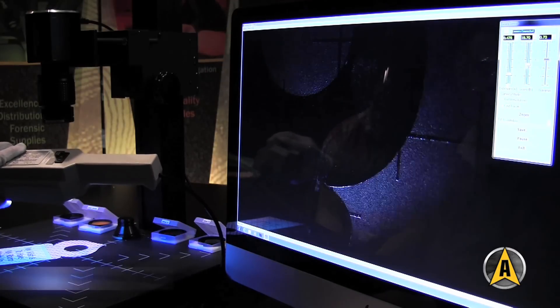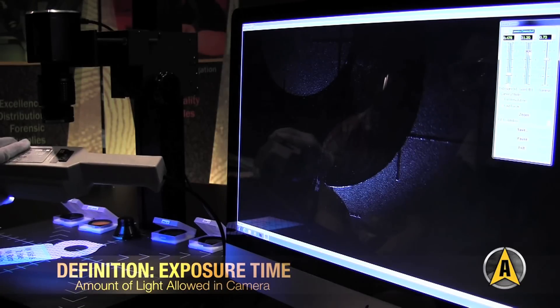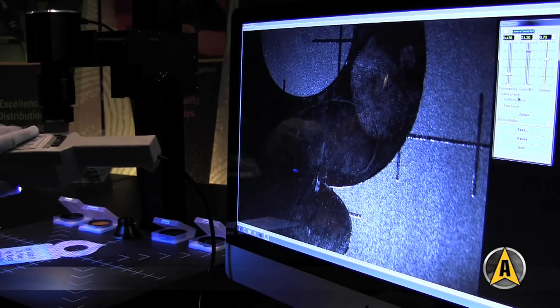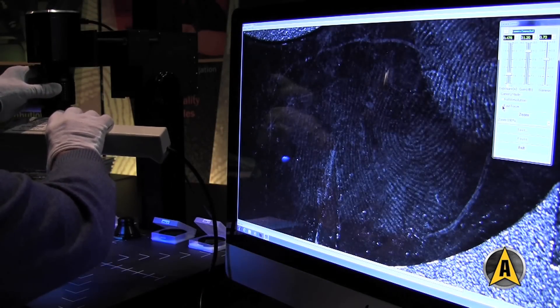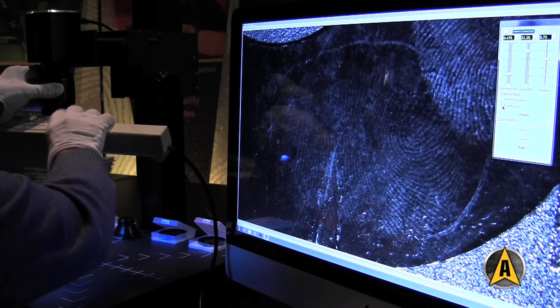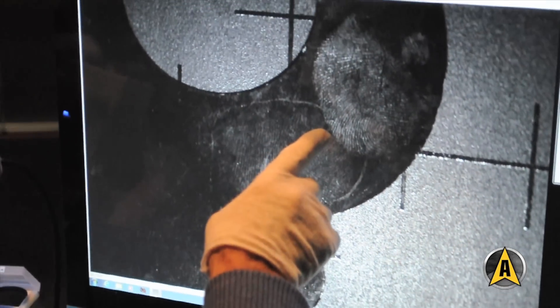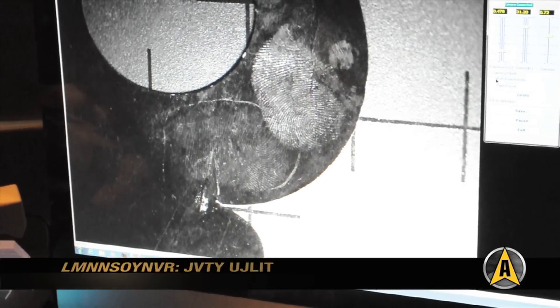Now, let's crank the exposure time up. Now, let's switch into fast focus mode. This blows the image up on the screen so you can see the effects of the focus really well. There's a print that you can barely see with your eye, and there's one that you can't see. I press the foot pedal, and the image is saved.